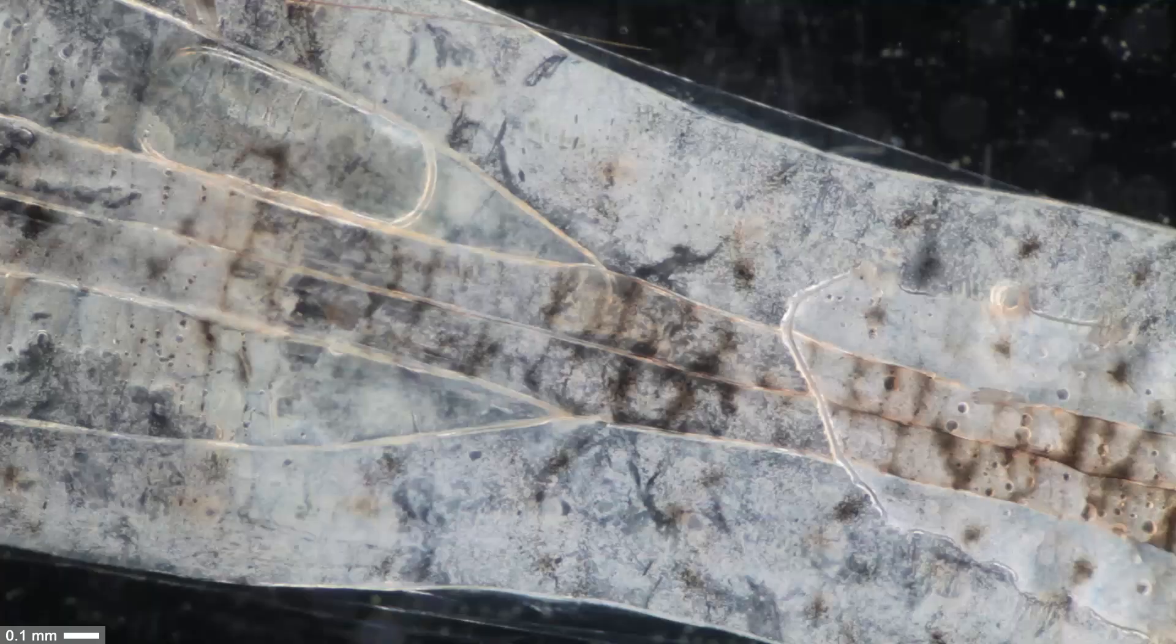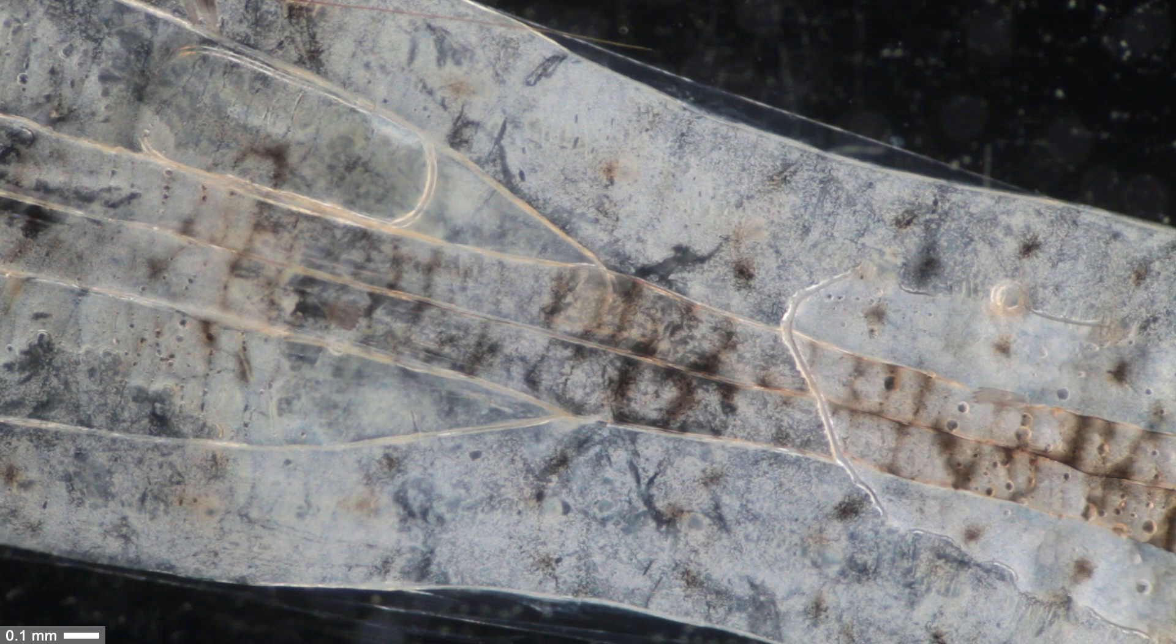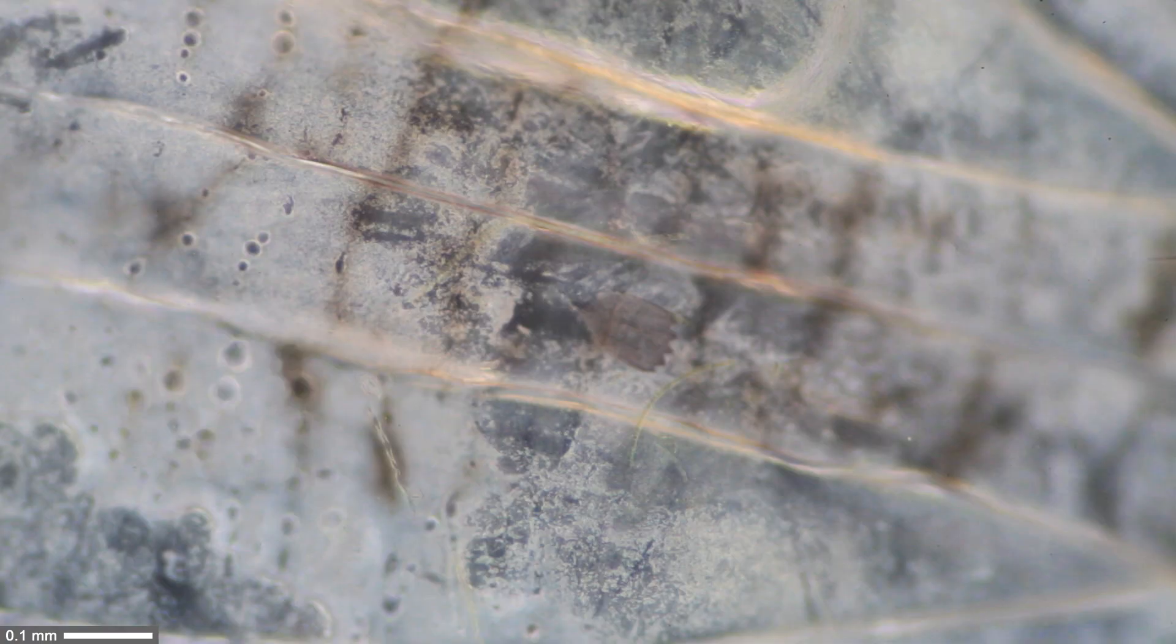This will make everything appear dramatically different, because now the specimen appears bright on a dark background. You can also see now different structural details. For example, the air bubbles, the oval air bubbles, they do not look as dark anymore. But you can also see some details there. If I zoom in a little bit with a higher magnification, you can now still see the scale in the center, but not very well. It's almost difficult to see.